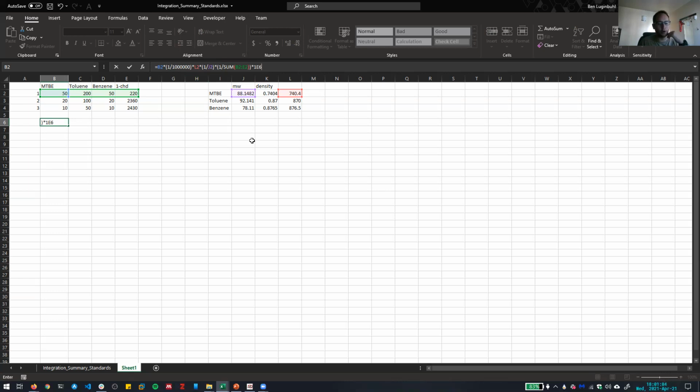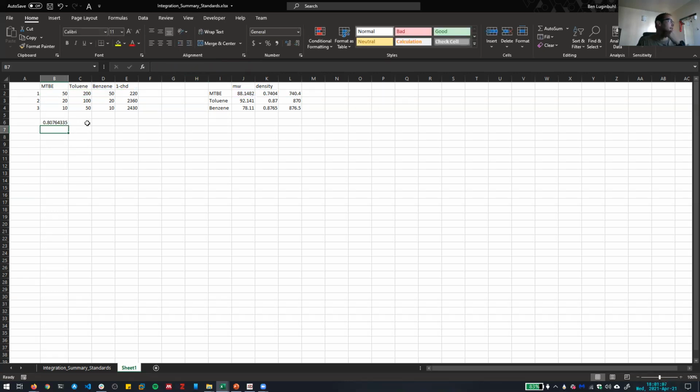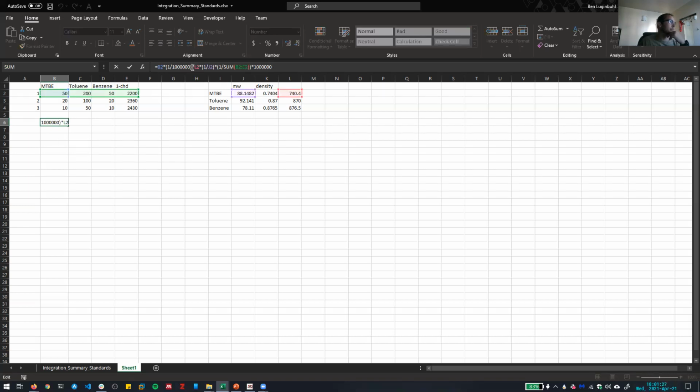So we can clean up our formula once we get this working here. So let's do that. And let me make sure that I add the correct number of values there. So 0.1168 approximately, right? And so you can go through and double check and make sure that we did the math correctly for that. But now that I notice that we have this extra thing in here, why don't we just go through and modify this formula? We can take out that correction factor to go from microliters, and same with that one. And that should give us the same number. Yep, good. So now we've done the heavy lifting of making this formula work.